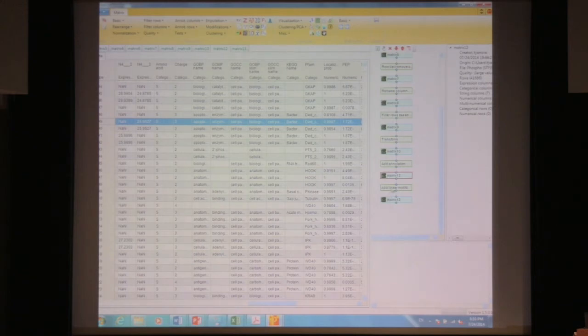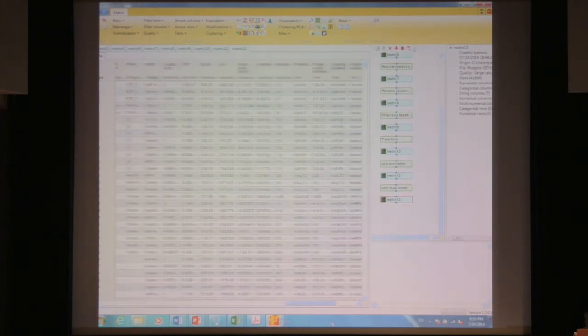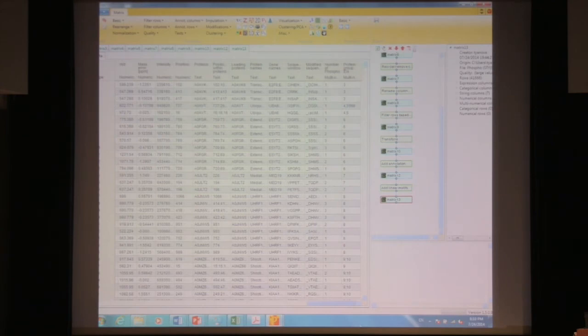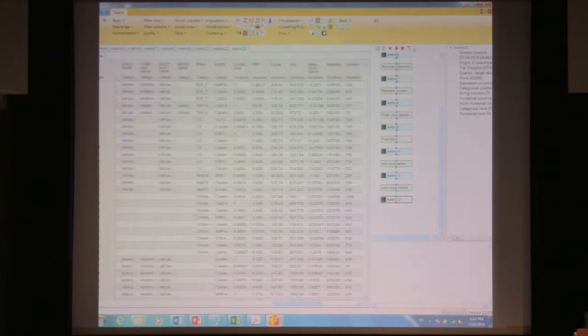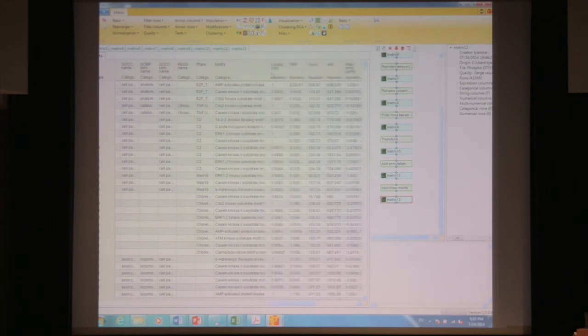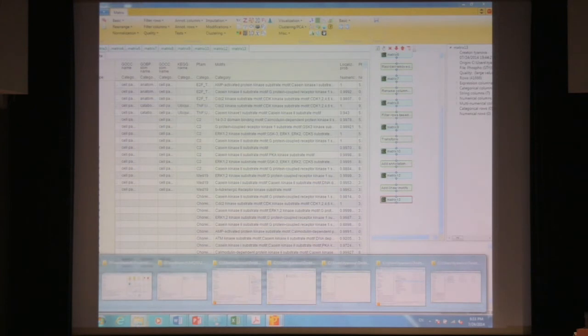The second thing that I added was the linear motifs. And that adds this column here, motifs. In case you wanted to define your own motifs here, the way that it generates this sequence-specific annotation can be modified by you.